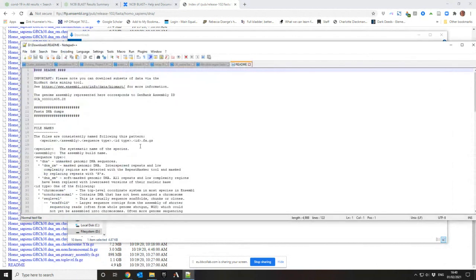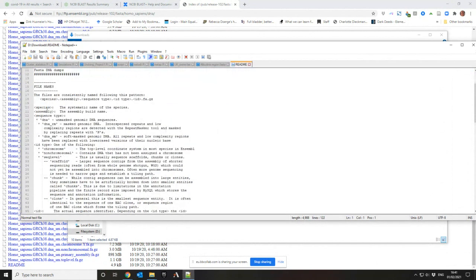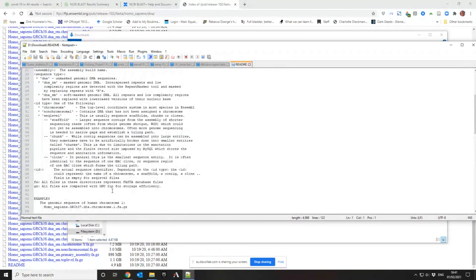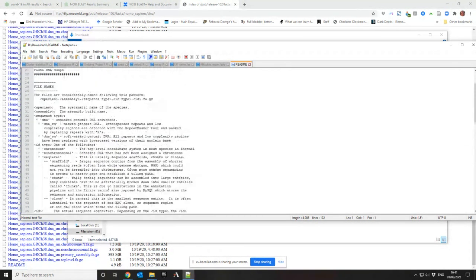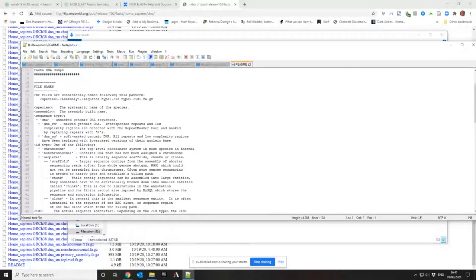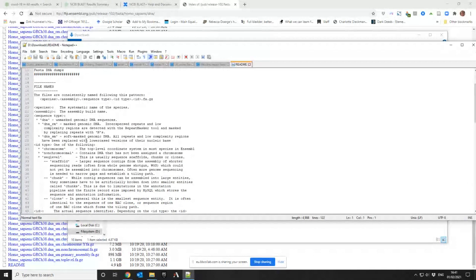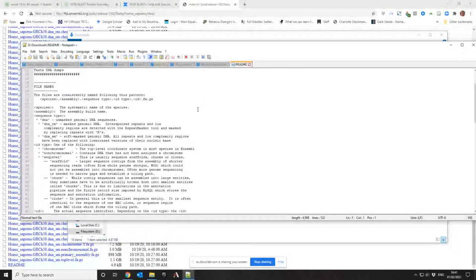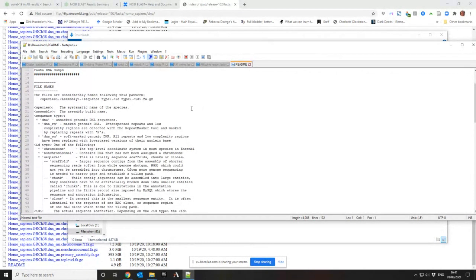You can use BioMart to do the download instead of grabbing it this way because this is a bit slow. RM is masked genomic DNA to get rid of the repeats and low complexity regions. So what's SM then? SM: soft masked. Repeats and low complexity regions have been replaced with lowercase letters instead of actually removed completely.